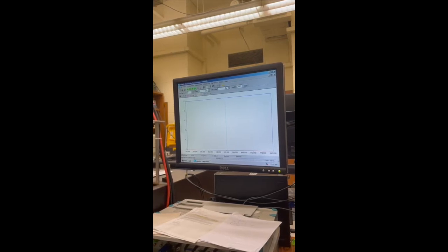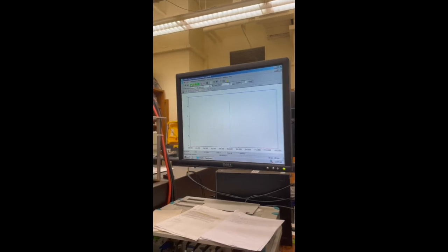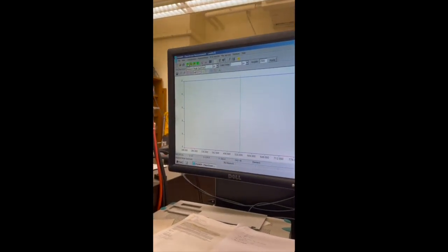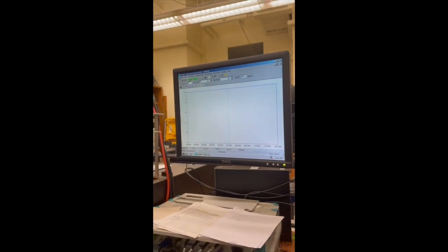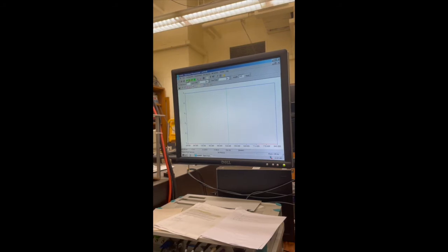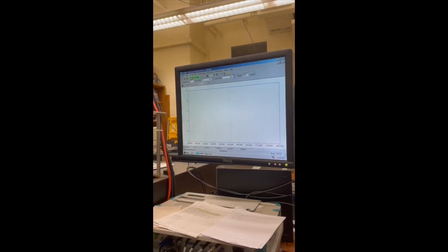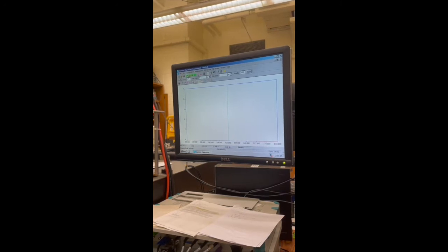Right. So when you hit that button on the left, go ahead and hover over that. It says measure a single spectrum. That's what we want to do. So we're going to hear the laser fire 3 times, or we better, and then we'll see a spectrum appear on the screen, which will indicate that you've actually shot your steel correctly. So I think we're ready to do it. Go ahead and try that.